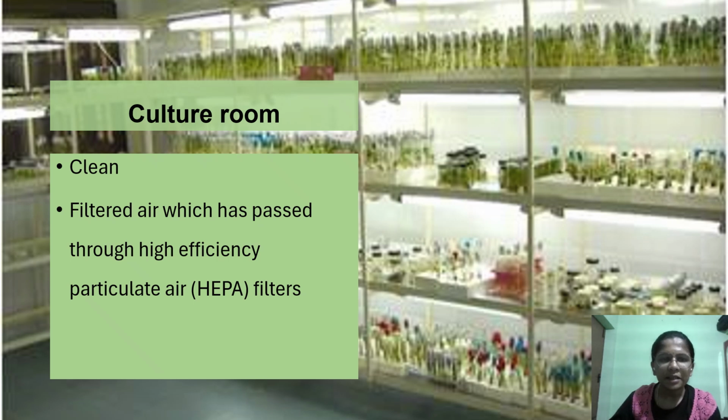So ethanol is the commonly used sterilant here. And if the contamination is more in the culture room, how to avoid this? Normally, we should always keep the culture room in good condition without any infestation. And we can restrict hair entry and other things. And as I mentioned, they can use a lab coat, and they can also practice laboratory safety practices in a proper manner in order to avoid contamination.